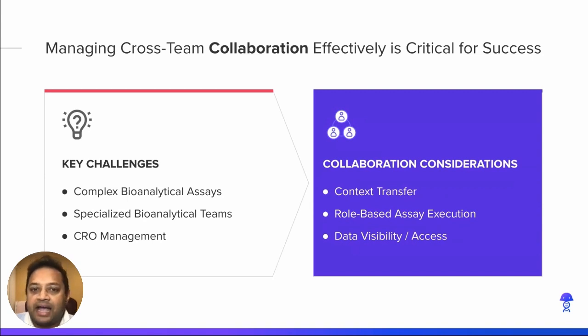Bioanalytical development is highly collaborative in modern R&D organizations. There are specialized subteams or team members that manage incoming and outgoing biosamples, develop complex assay methods, execute sample analysis, provide compliance oversight, and author reports and regulatory documents. Depending on the organizational size and setup, any or all of these activities can be performed by specialized team members.